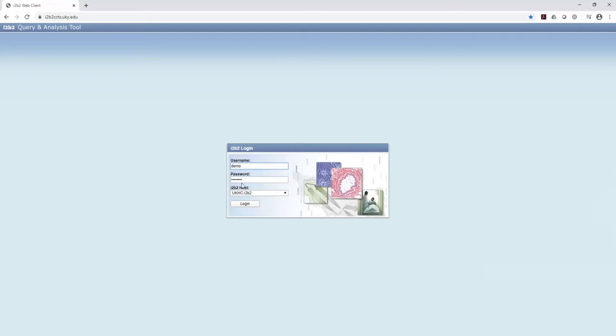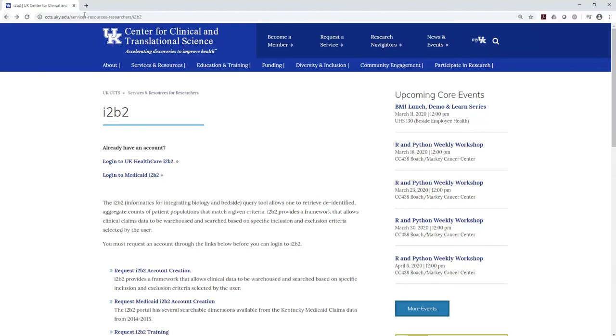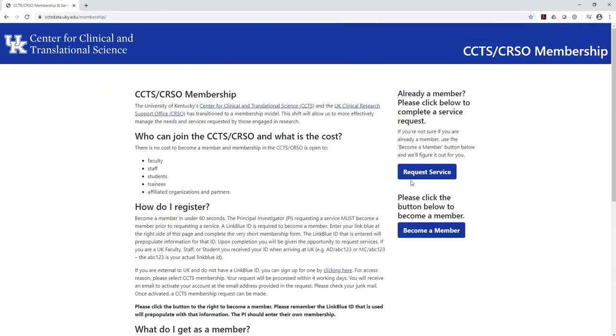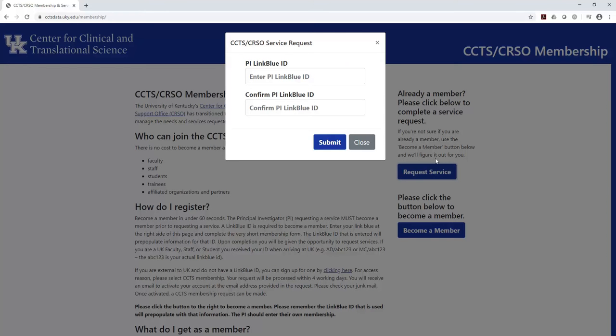And if you click on that, we're going to want to log in to the UK Healthcare I2B2. So to get further, we need a username and a password. If you don't already have a username and password, what you can do is you can go back to our CCTS page, and you can request a service.